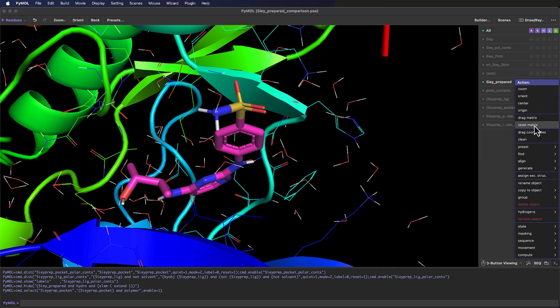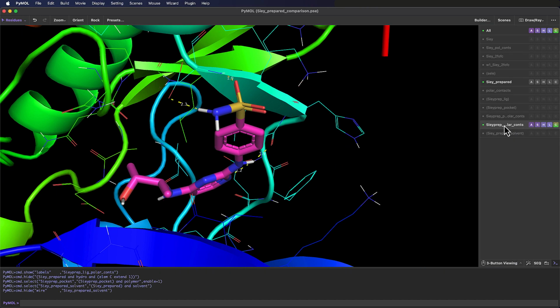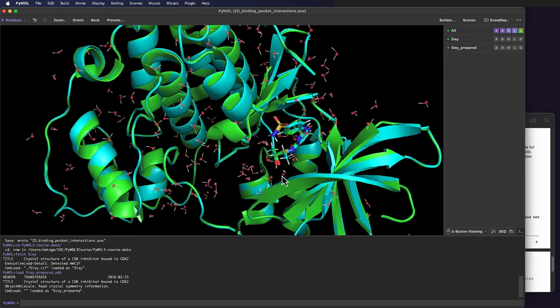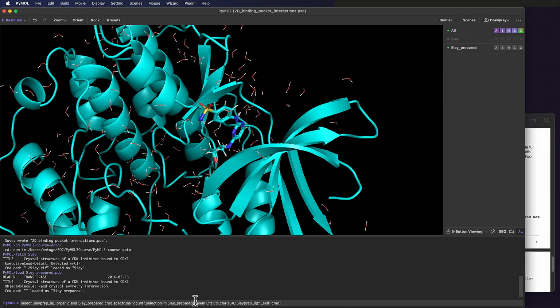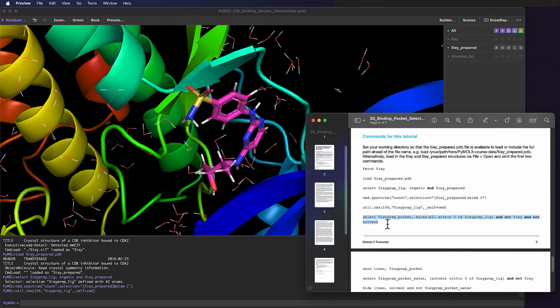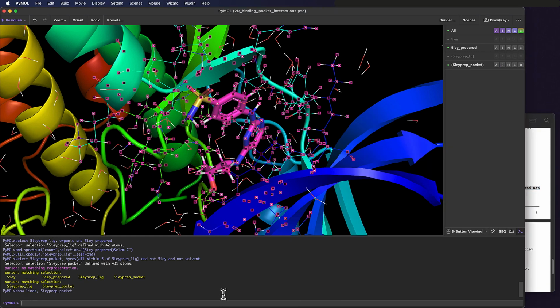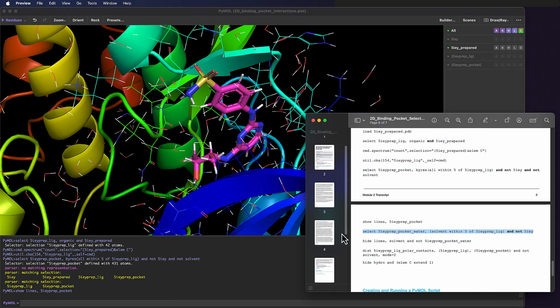In this tutorial, we have created selections, found interactions, and displayed labels, all using the GUI. A powerful feature of PyMol is that we could also perform all of these actions by typing commands into the command input area, or by writing a script to automate the process. For online course participants, a list of the commands is available in the downloadable transcript for this video. Have a go at redoing this tutorial with commands, and check out the selection algebra, property selectors, single word selectors, and colouring references on the PyMol wiki for more guidance here.